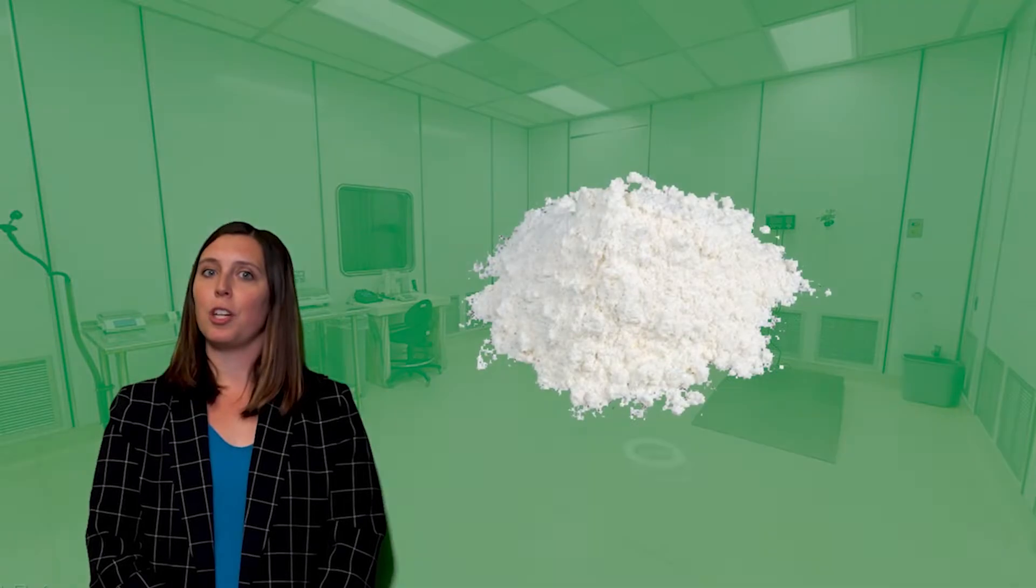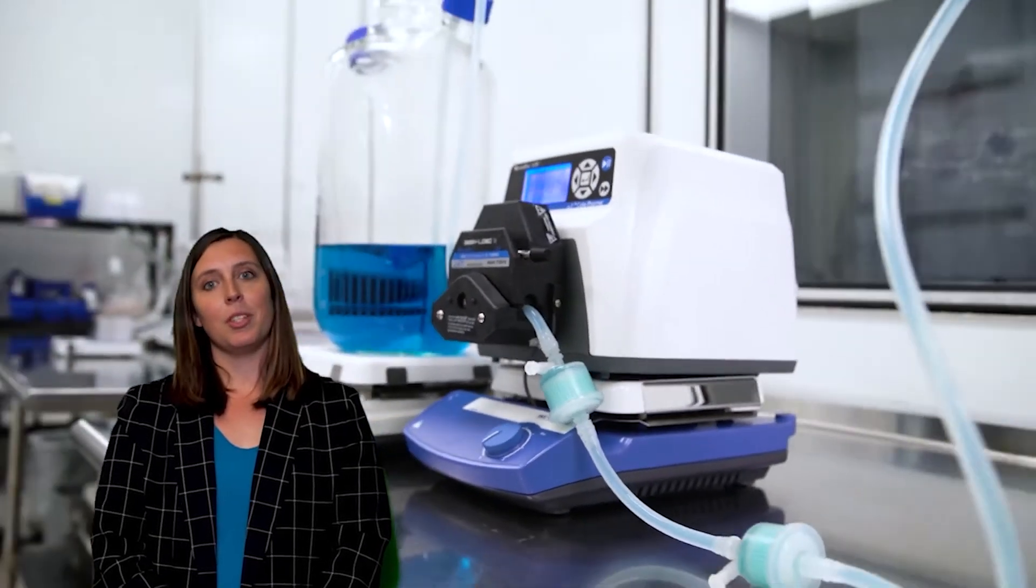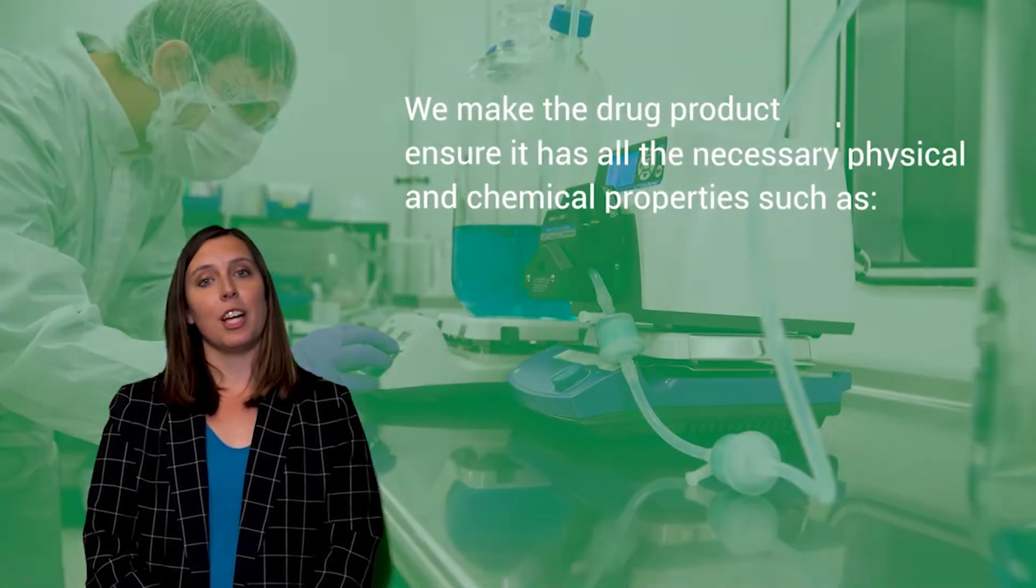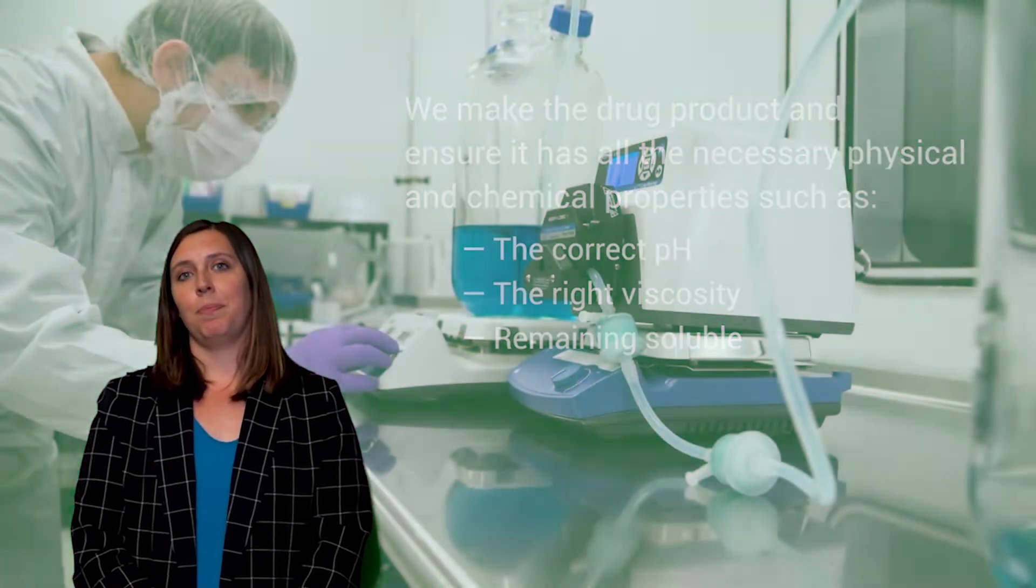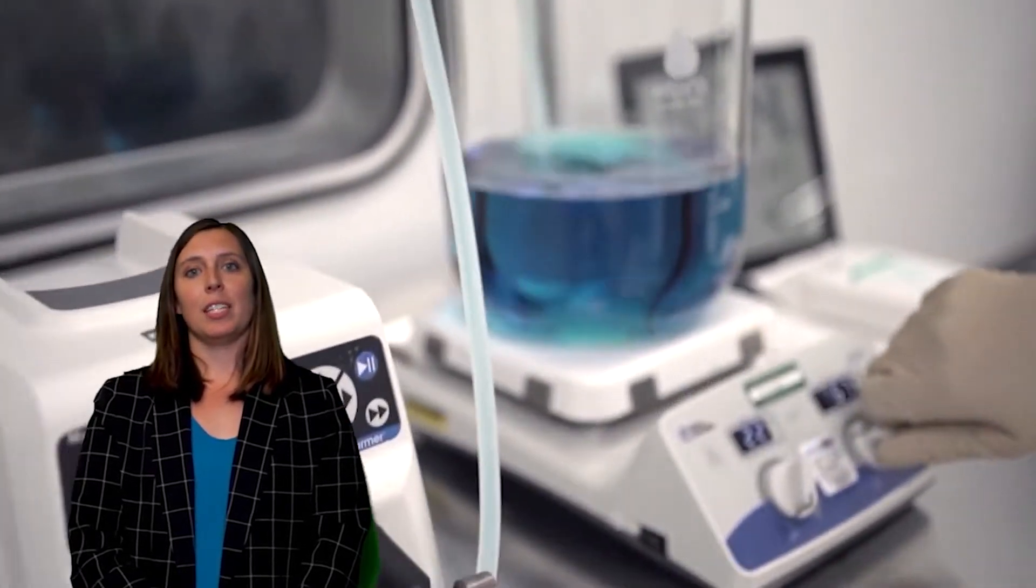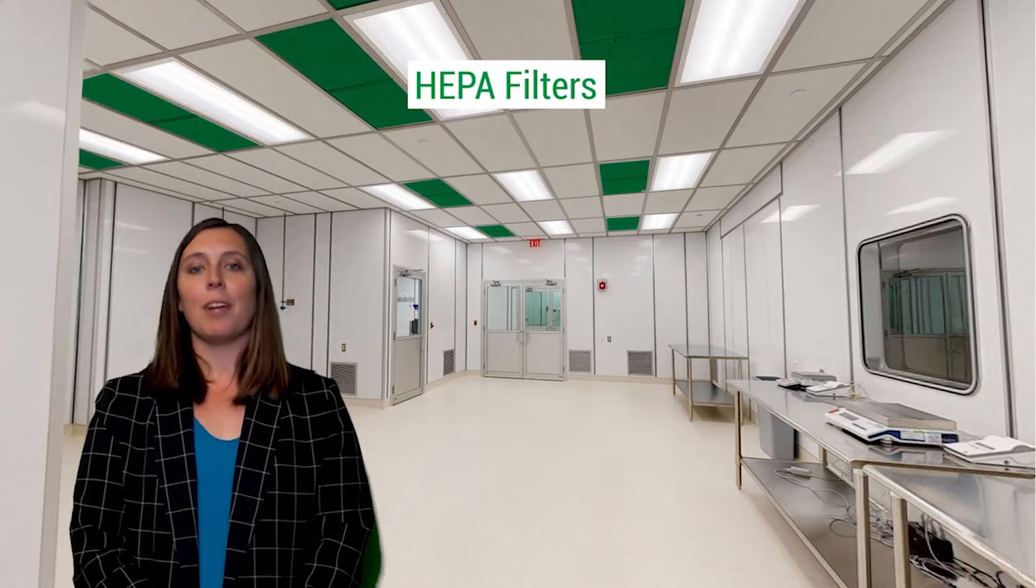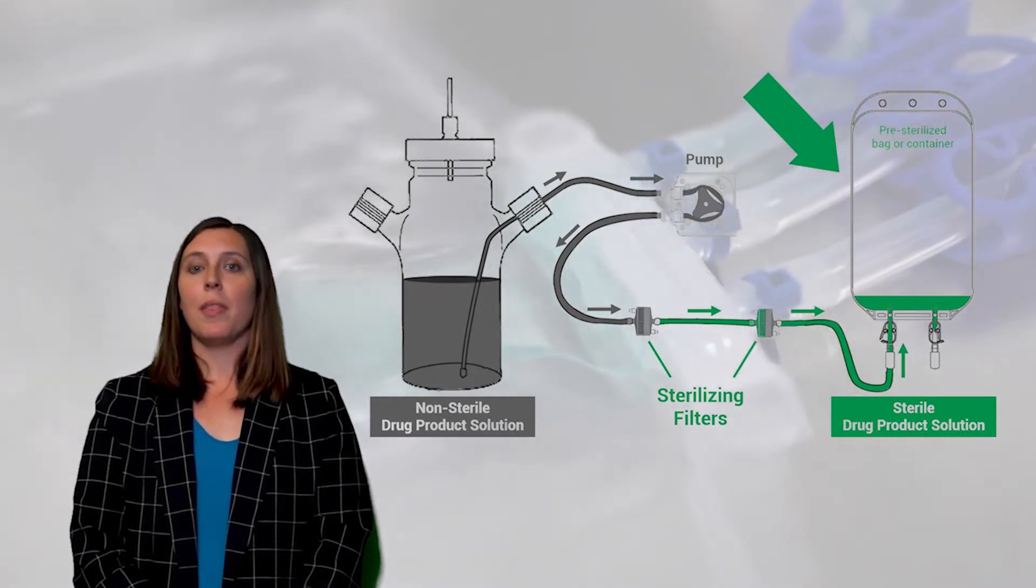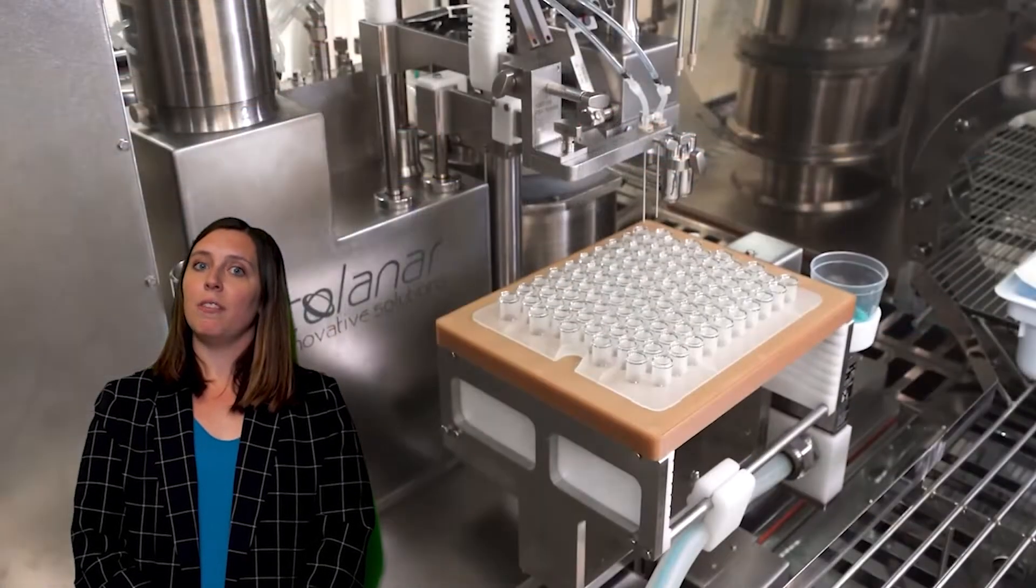Our customers, pharma and biotech companies, typically send the active ingredient for their drug to us as a powder. We put this powder into solution and add any other necessary salts or chemicals to meet their physical or chemical requirements, such as having the correct pH, the right viscosity, and to ensure the active ingredient remains in the solution. Once we create the medicine, we then sterilize it by filtering it through two or three sterilizing filters. This work is performed in an ultra-clean environment. All the air in the room is filtered through HEPA filters and replaced every minute. The sterilized drug product solution is transferred to a sterile vessel that will then be transported over to one of the two filling lines that you just saw. The container is connected to the filler and filling begins.